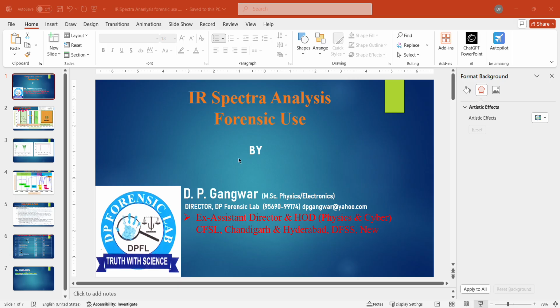In the double bond region, the carbonyl group C=O gives a very strong, sharp peak around 1710. This is very important in many compounds. A single peak can be very helpful for identification of a particular compound.